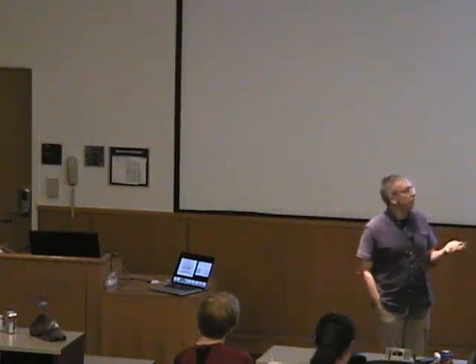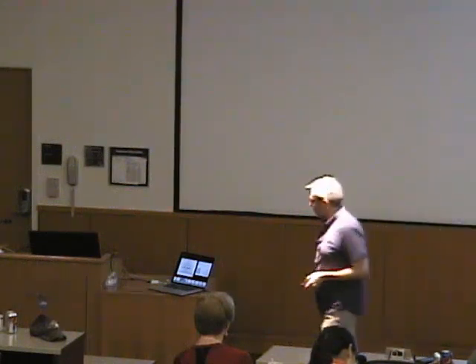And that's kind of convenient because it more or less fits the definition of light microscopy, where you can say if you can distinguish 2 points, then that's the resolution you have. So you do need a resolution below 1.5 angstroms to get individual maxima for 2 carbons in a CC bond. But the definition of it is really that: it's the reflections, the furthest out, defined by the HKL indices, that we actually record.